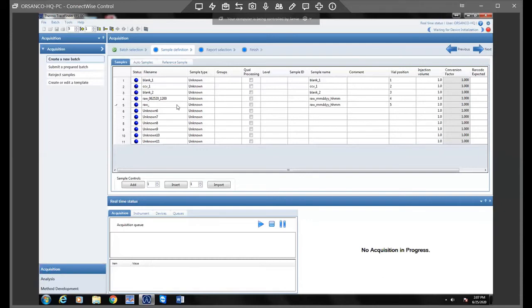I believe you can actually copy and paste. Oh, there it is. I did Control C to copy the cell here, but when you paste it, you have to make sure you've highlighted it, or else it won't actually do it. I just tried it there and it doesn't work, but if I highlight it, maybe now it's gone. So either way, I'm going to change this one to a different time.